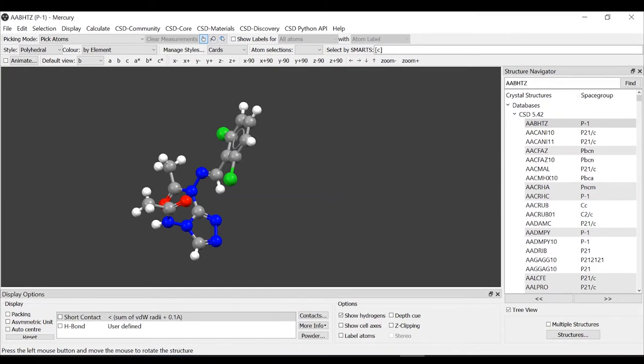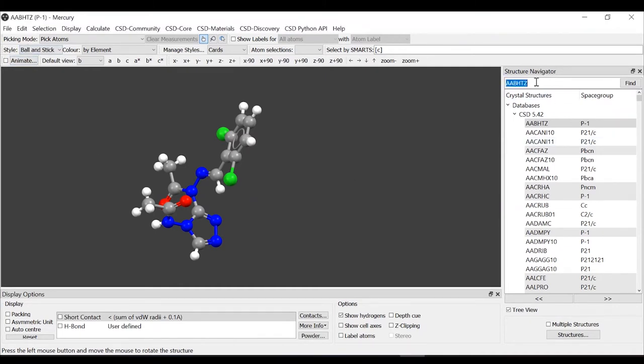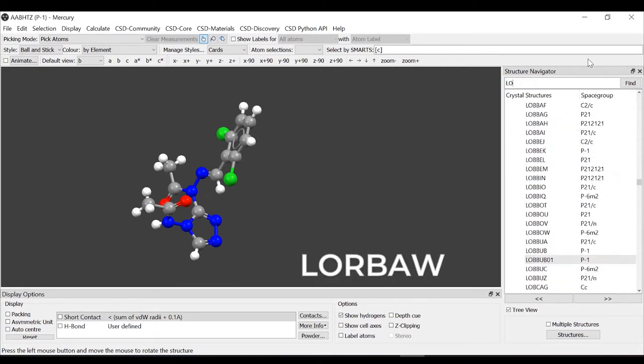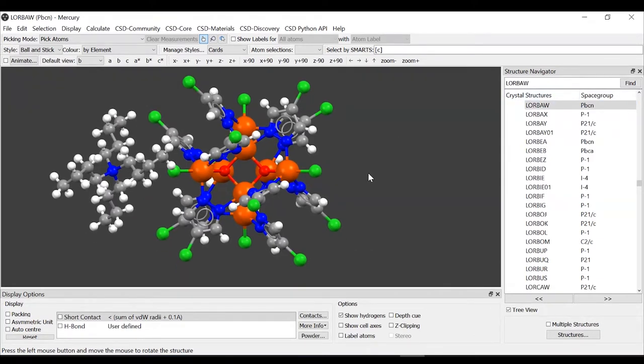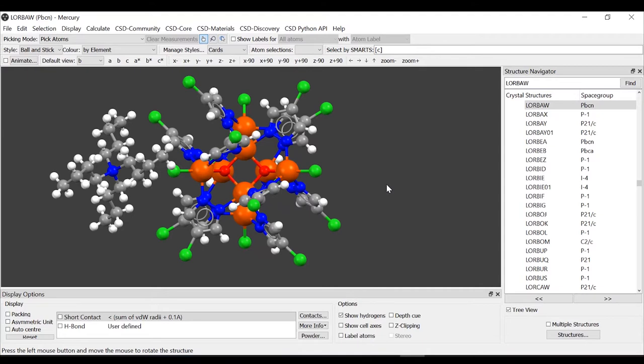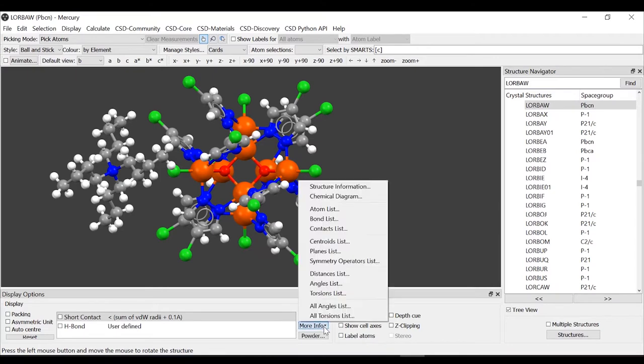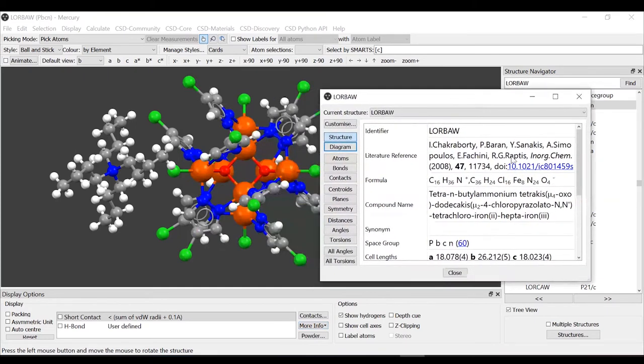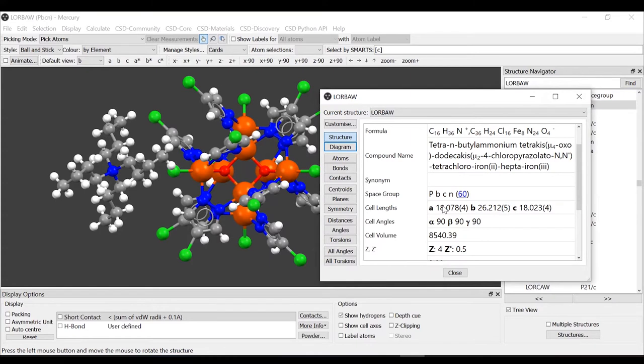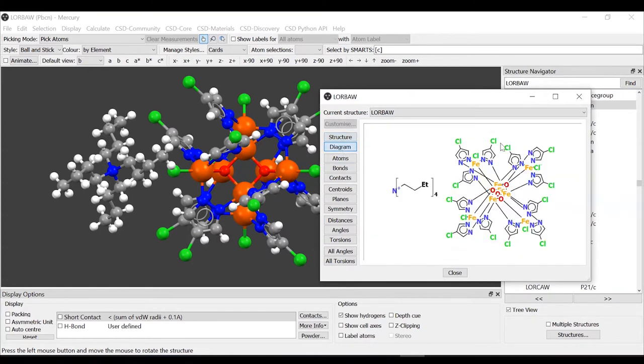The next thing we're going to see is different styles from here. We're going to change refcode. In the structure navigator, we use LORBAW. This is the structure that you also saw in the slide. We want to see how we prepare the image that was on the slide. For this structure, we can learn a bit more about it again from more info, structure information. We can see the identifier which we just inserted, the formula and the compound name. We can again see the 2D diagram to see which elements are represented.